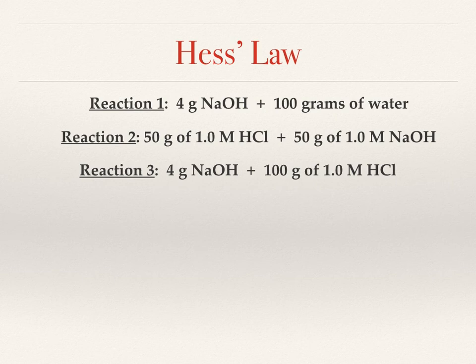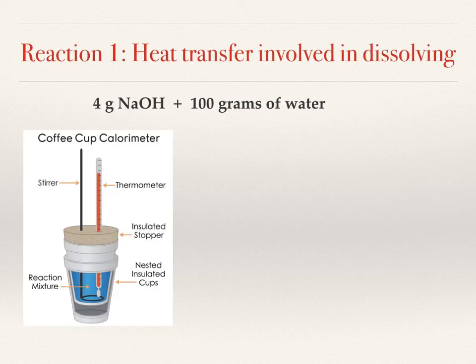So we did this in a coffee cup, as is often done in a high school chem lab. Basically it's just a reaction vessel, and we try to keep it as insulated as we can and minimize heat loss to the environment. So this data is from a group from Mrs. Bram's class. This is Carolina and Renee, so thanks in advance for all the data here.